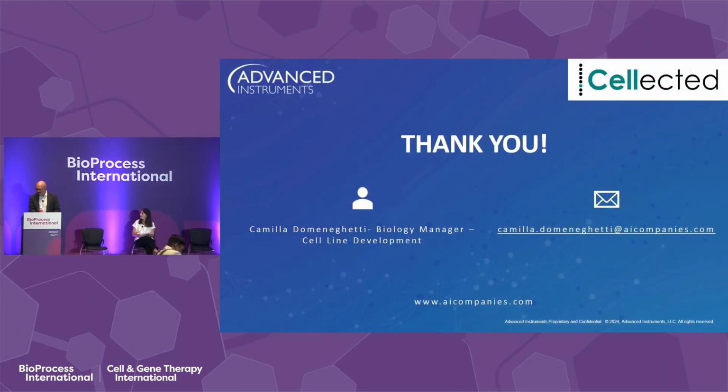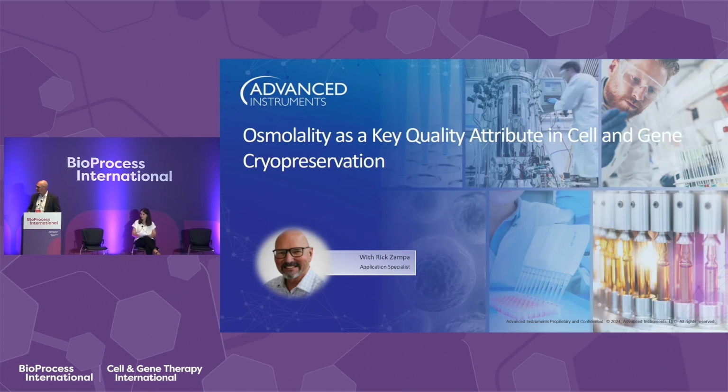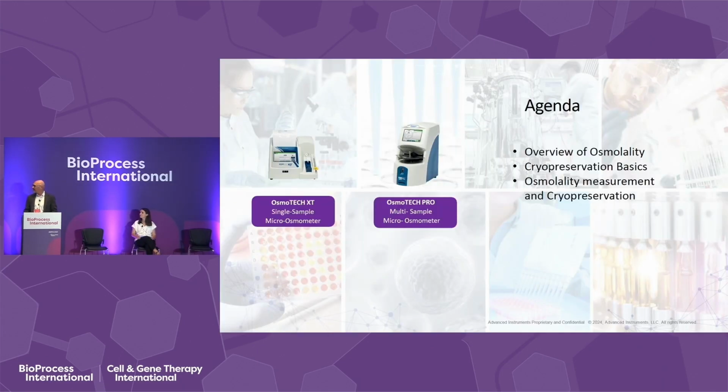I'm going to go on to the next section of our presentation. Osmolality is a key quality attribute in cell and gene therapy cryopreservation. First, a quick agenda: an overview of osmolality, some cryopreservation basics, and then how osmolality fits into the cryopreservation process.